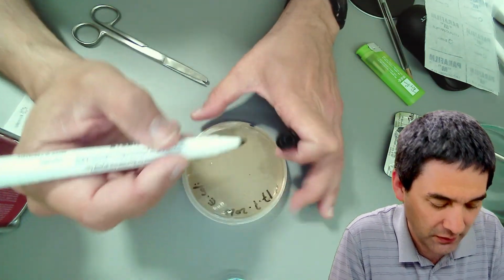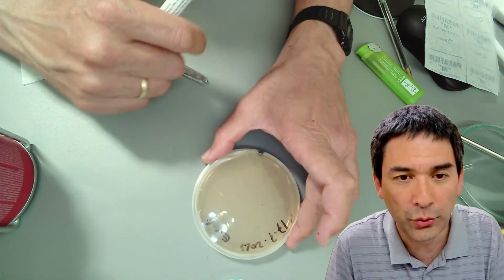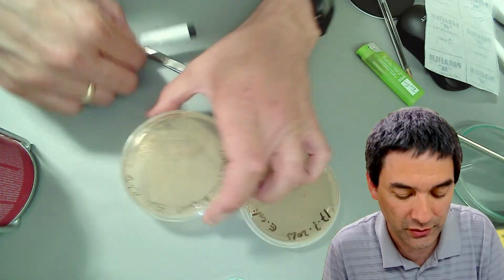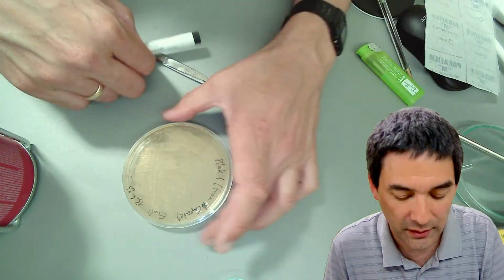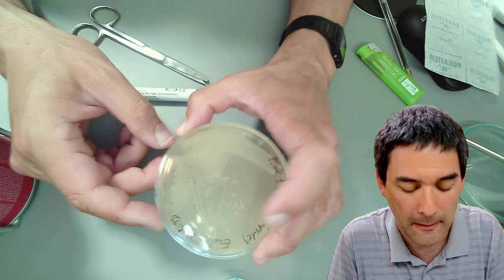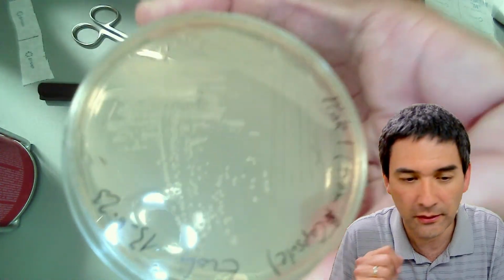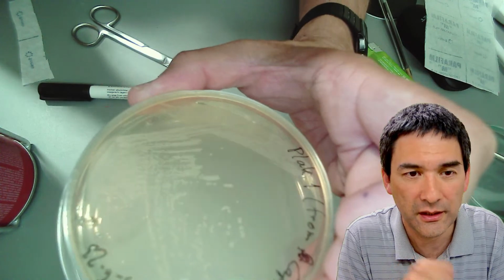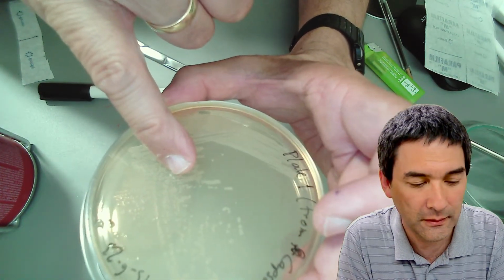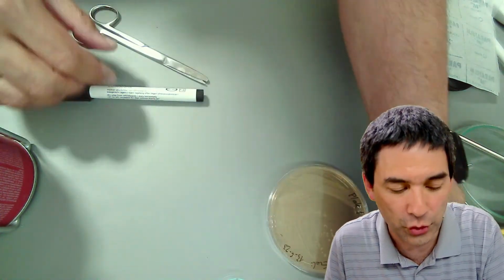So the 17th, okay. I'm going to wait now for 2 days, and then I'm able to see what. What am I able to see after 2 days? Well, this one over here. The plate that I showed you, you can see that I made this on the 13th. Let's go again here a little bit, and you're able to see that the individual colonies are visible. 17th of June, not July.